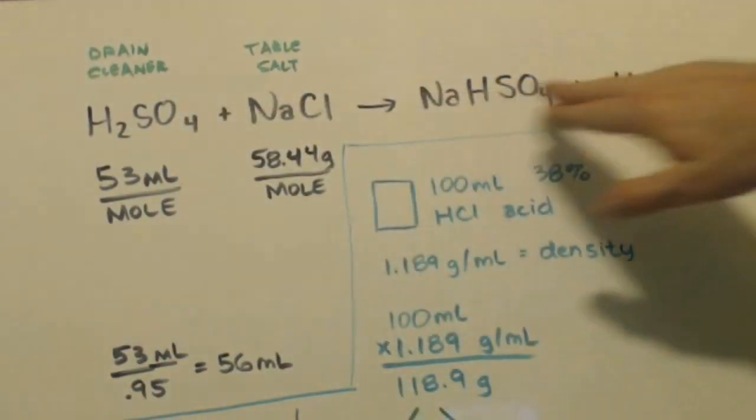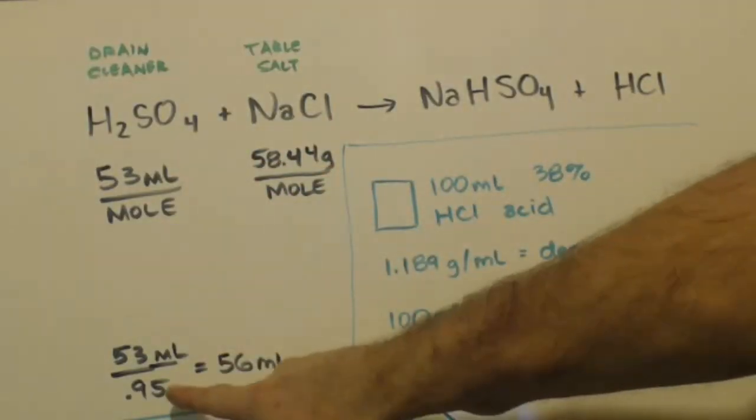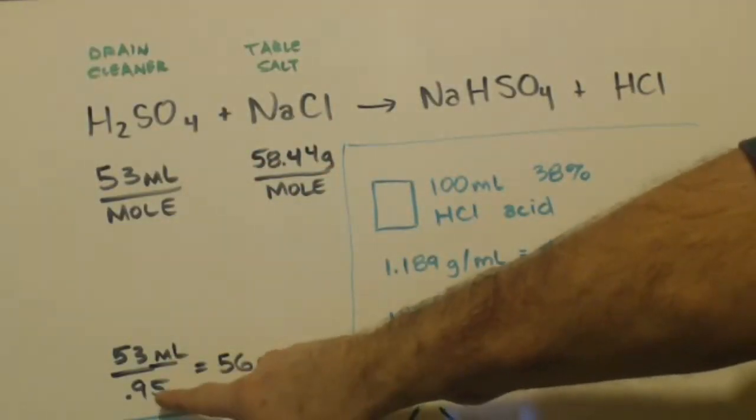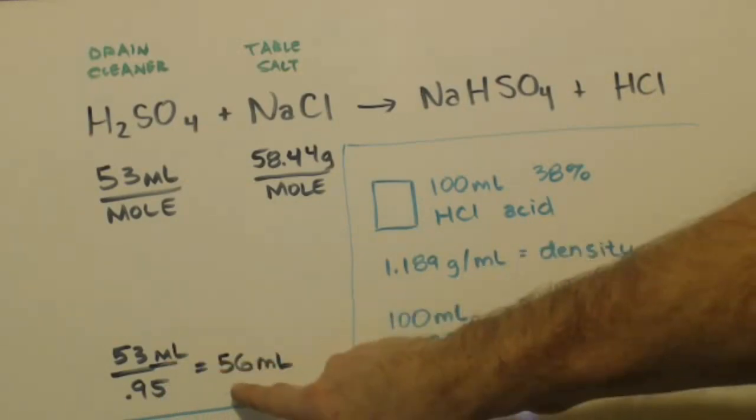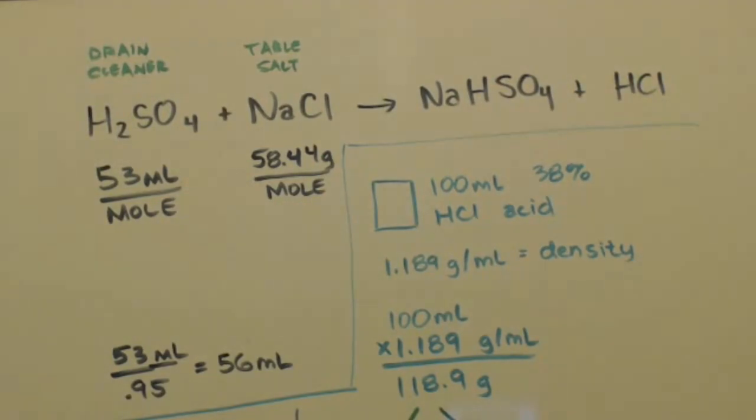Alright, here's the equation. Here's your molar masses. I'm guessing I have 95% sulfuric acid, so I divide by 0.95, and I get 56 milliliters for that, and 58.4 grams for that.